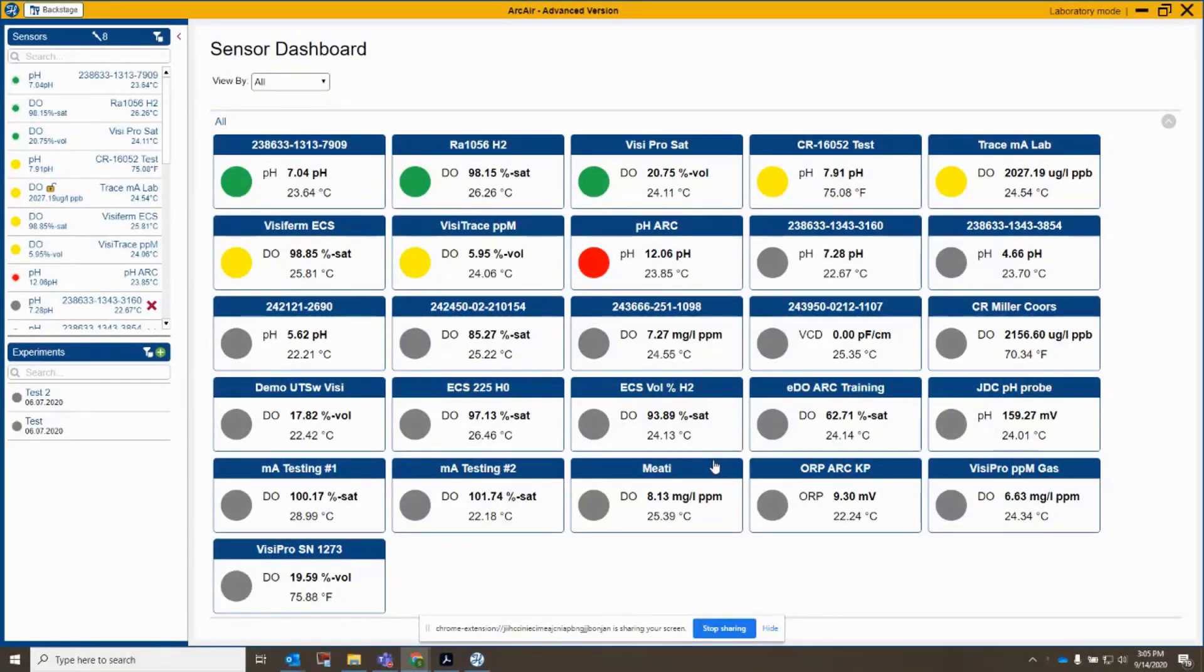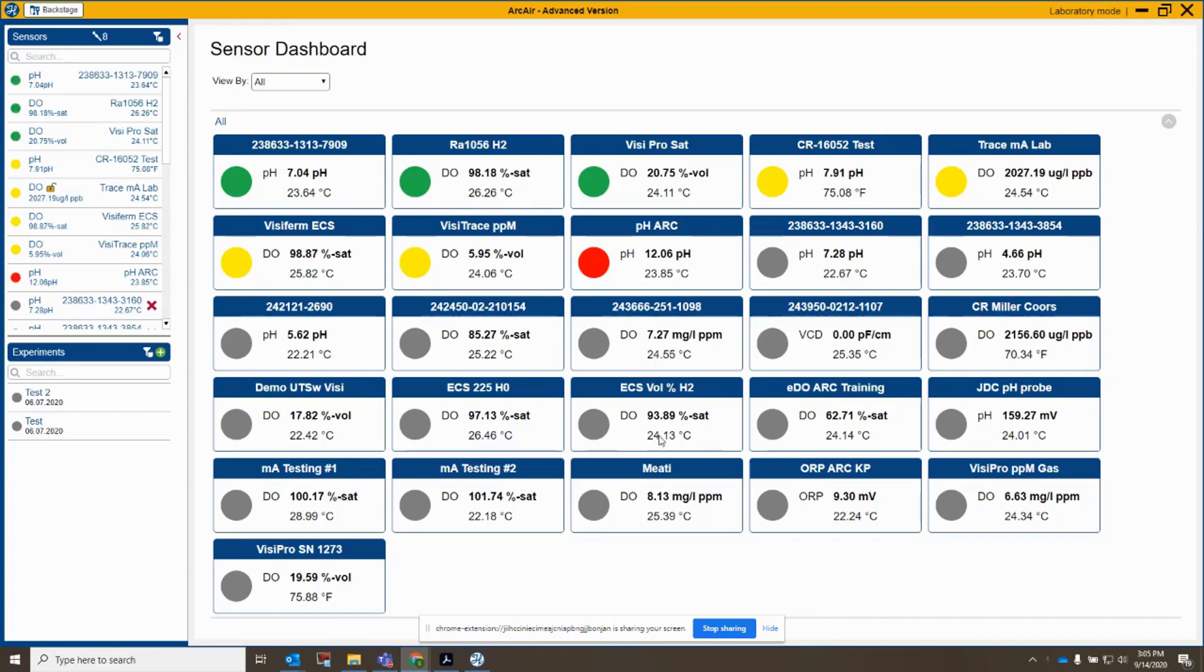Okay, in this video we're going to go through some pH calibrations. We'll go through a two-point calibration, then a single-point product calibration.